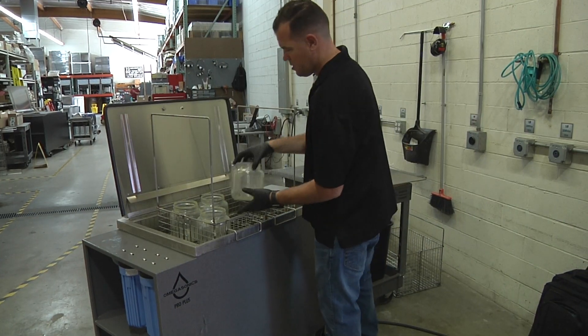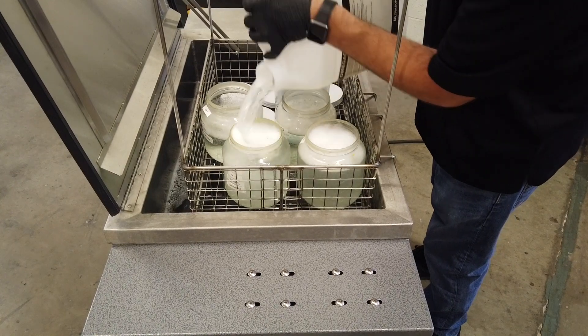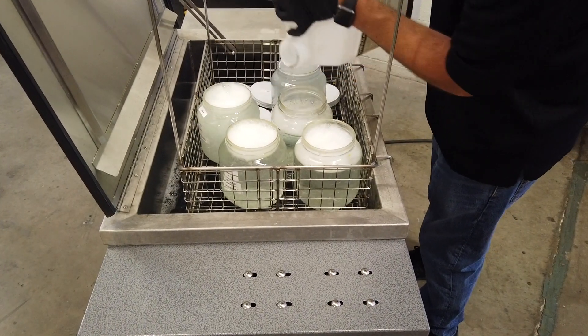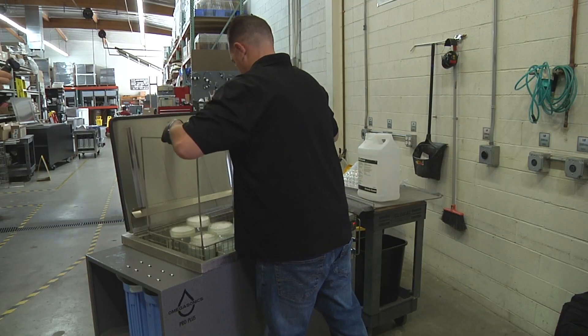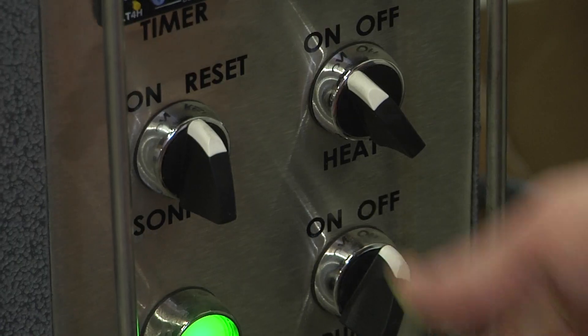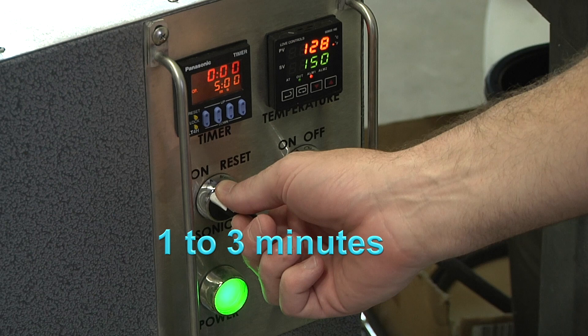Place the glass jars upright into the basket and fill each jar with liquid to avoid creating air pockets inside the jars, which will compromise proper cleaning. Place the basket into the tank and operate the ultrasound for approximately one to three minutes.